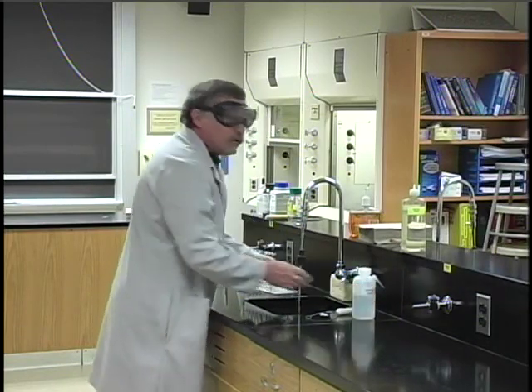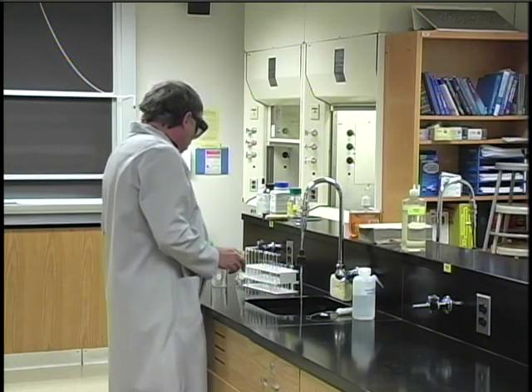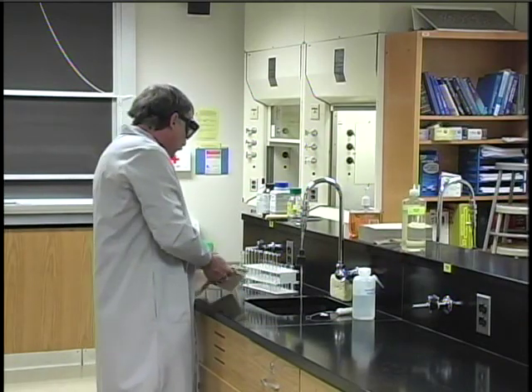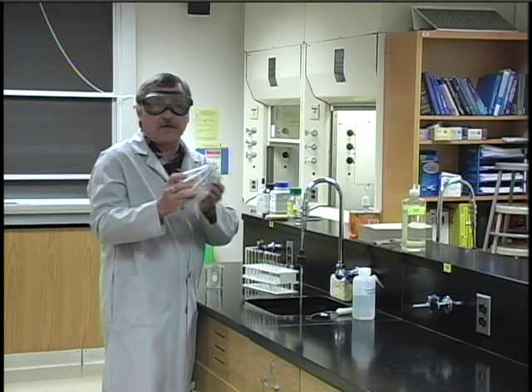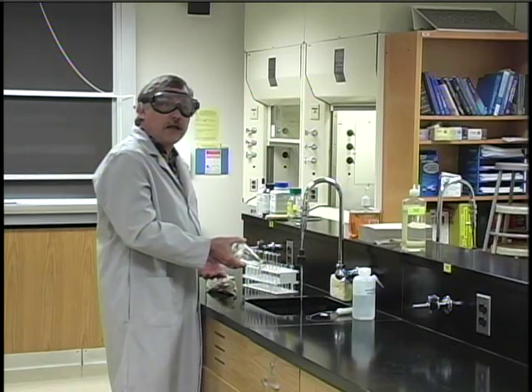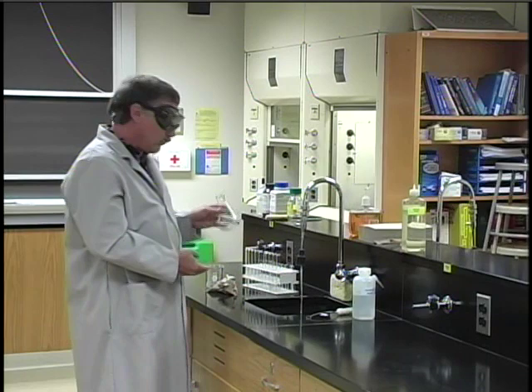At this point, if it's something like a test tube, you can just put it upside down in the test tube rack to air dry. If it is something like a beaker, dry it out with paper towels before you put it away. If it's something awkward to dry like an Erlenmeyer flask, shake out as much deionized water as you can and then put it away in your lab station where it will eventually air dry.